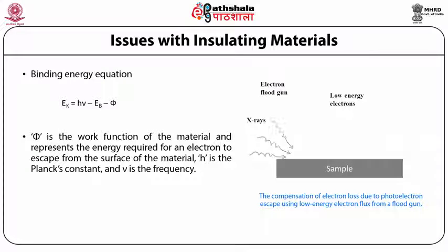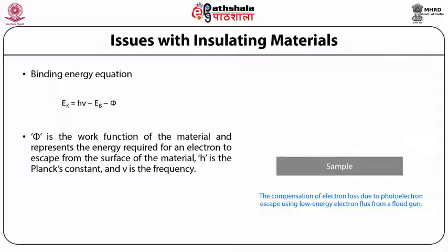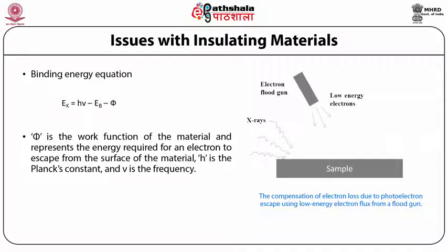This build-up changes the surface potential of the material during XPS data acquisition. In insulating materials, the incident electrons cannot be removed by electrical conduction, leading to charging the surface negatively in AES.